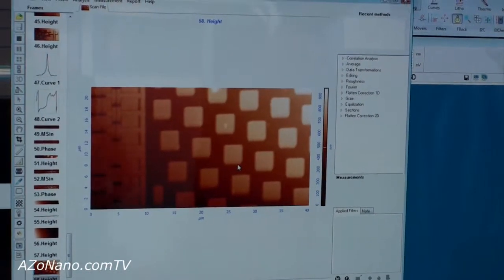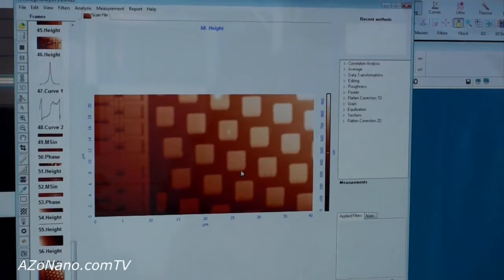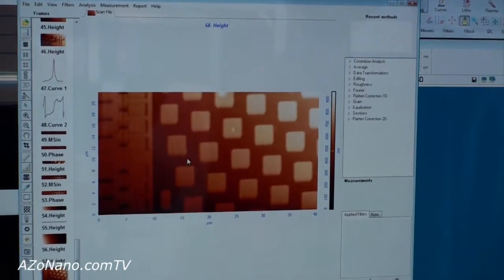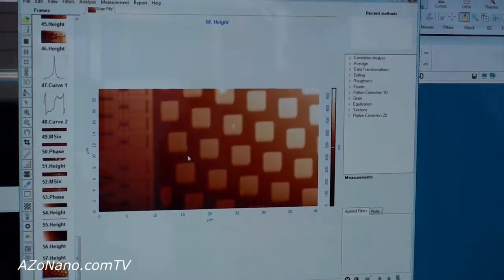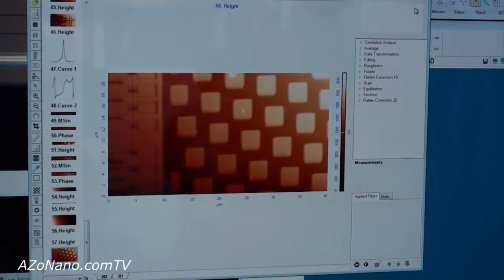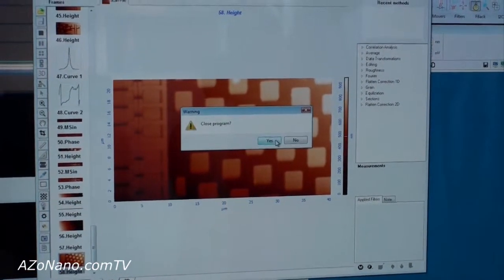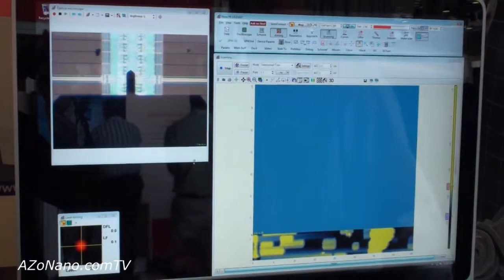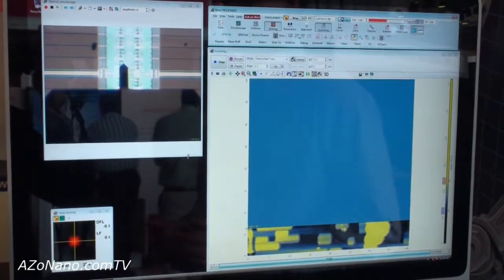There is a powerful image analysis software which you can use to measure linear dimensions and angles, get statistics like roughness analysis or particle size analysis, and so on.